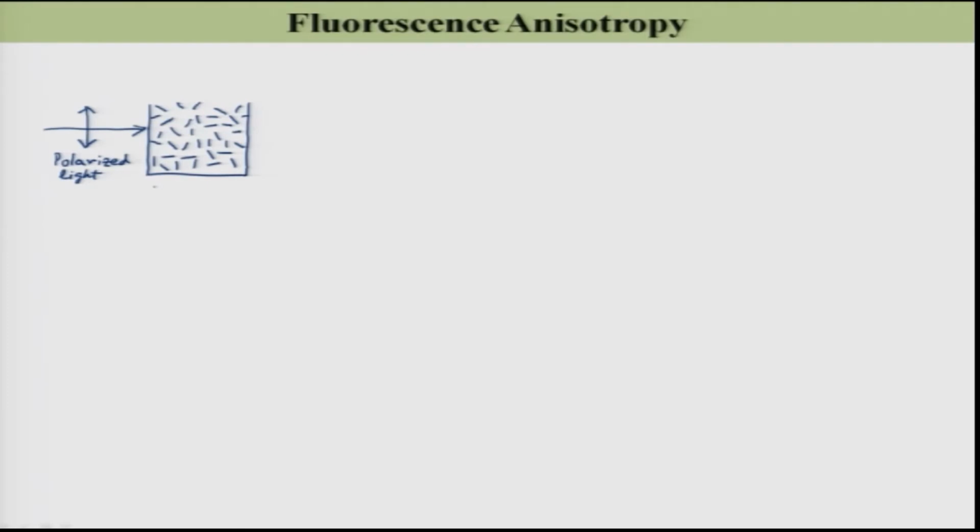So, this is my ground state, and I write the isotropic orientation of the molecules. Now, let us consider that this excitation is a delta pulse excitation.